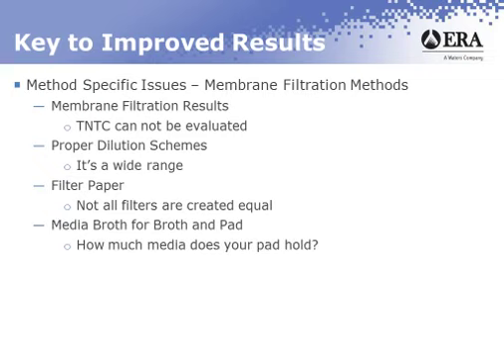Media broth for broth and pad. Pads must retain between 1.8 and 2.2 mL of broth. That's defined in Standard Methods. You need to confirm that if you're getting media that's pre-mixed in vials and you're cracking the vials and dumping them out. Make sure that what you're delivering to the pad falls within that tolerance.